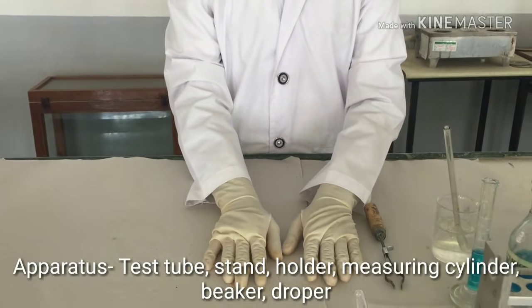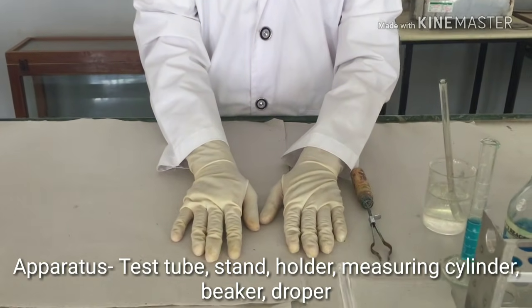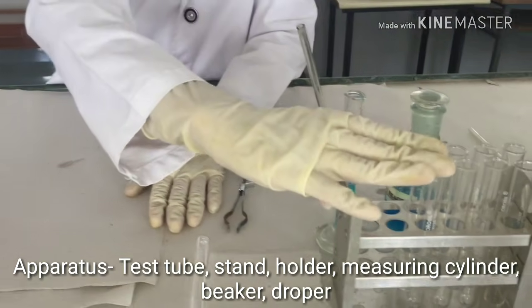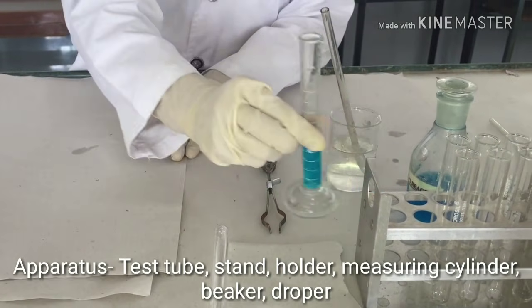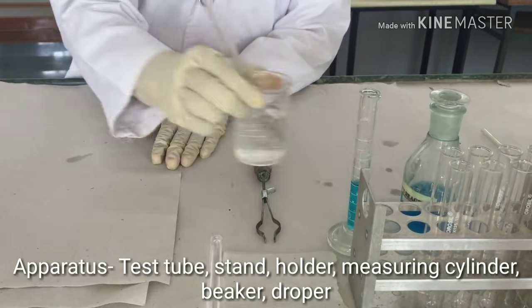We are going to perform the Benedict test. The apparatus used for this test are test tubes, test tube stand, a test tube holder, measuring cylinder, and a beaker containing the sample.